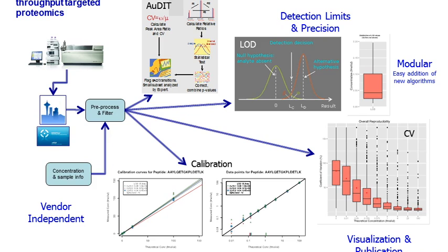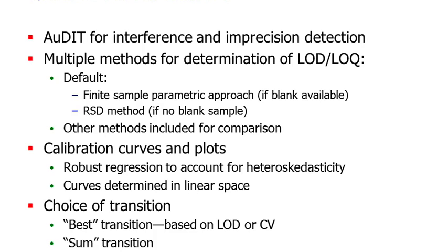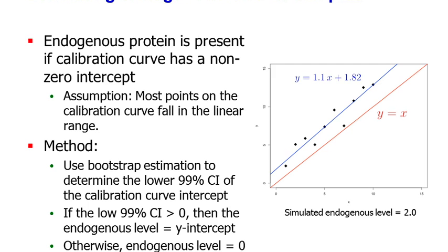So quickly, I think Sue showed most of the Quazar functionality, so I won't go into that. Quazar grew out of the LOD work that we did, and we added on other things that is now available as this package in Skyline. And also separately, if you don't want to use Skyline, you can also use it at GenePattern, Broad Institute. It's a standalone thing. And salient features I won't go into, Sue already showed it.